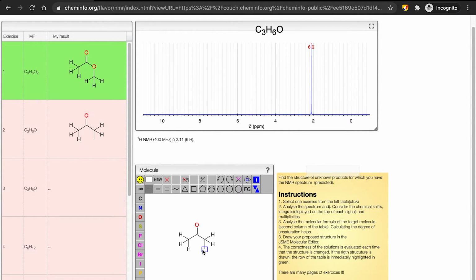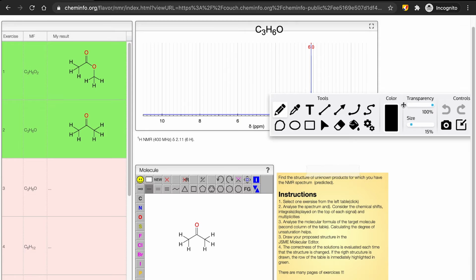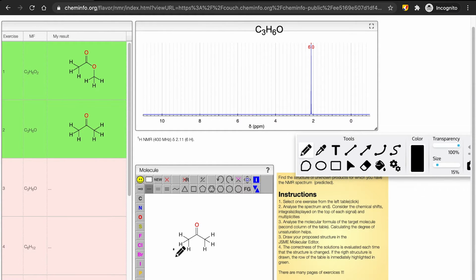Now in the spectra there's only one signal right here, a singlet at about 2.1 that integrates to 6 hydrogen. So in this case, all 6 of these hydrogen here are equivalent, okay? And that's because the molecule is symmetrical down the center. So these 3 and these 3 are all symmetrical, and they all contribute to the same signal, which is a singlet at 2.1 ppm that integrates to 6. So another fairly simple example. Okay.